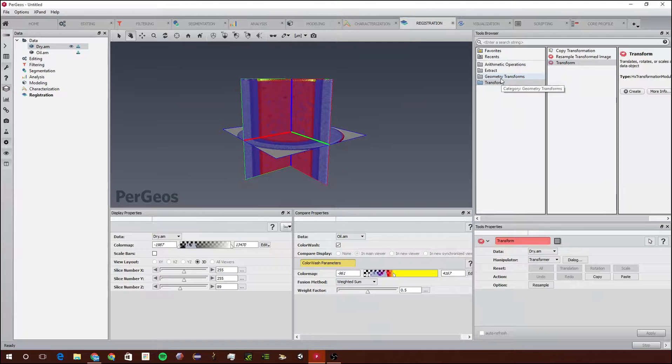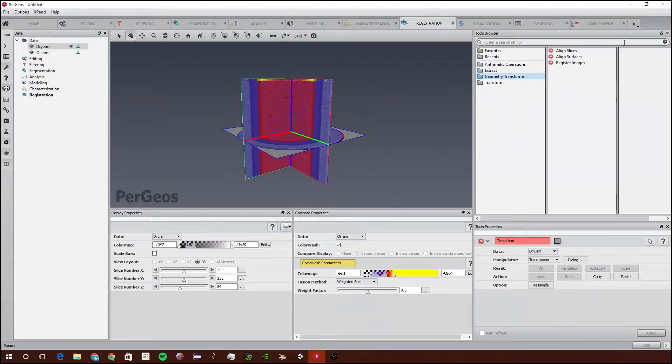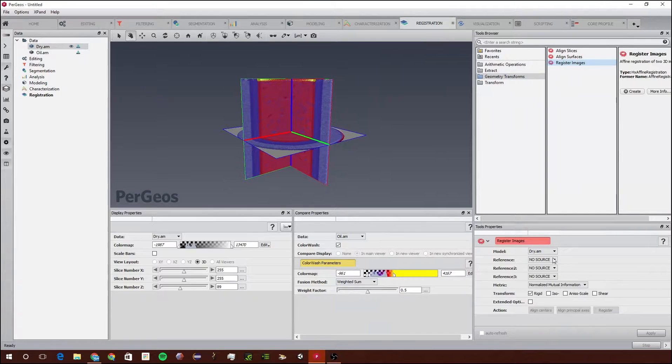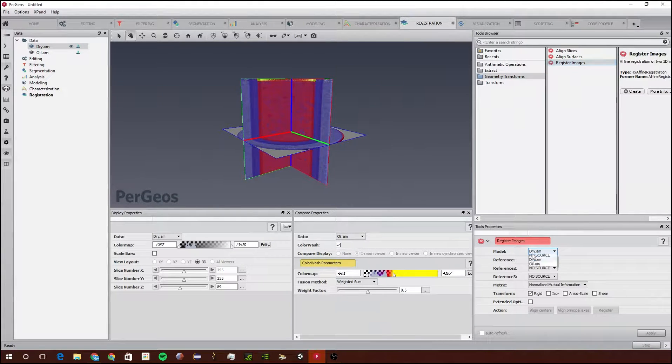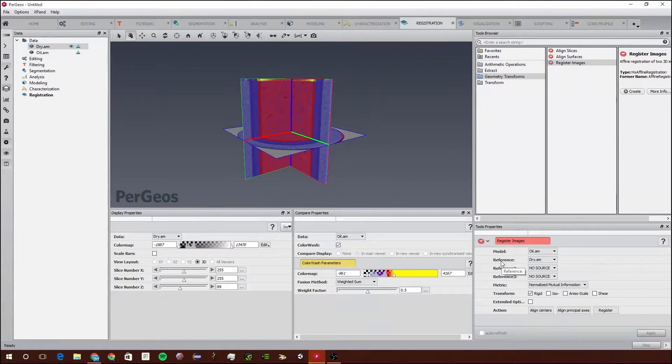Next we're ready to register the images using a formula. We're going to go to Geometry Transformations and Register Images. Make sure the model is oil.am and the reference is dry.am. So the model is the part we're going to transform to match the reference.